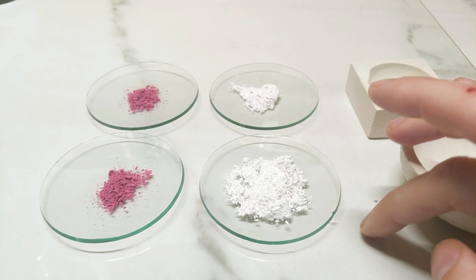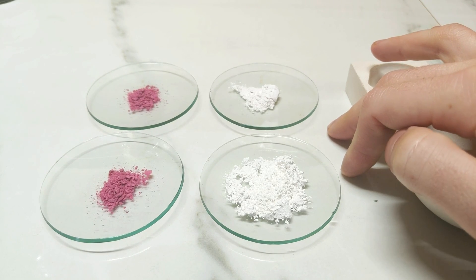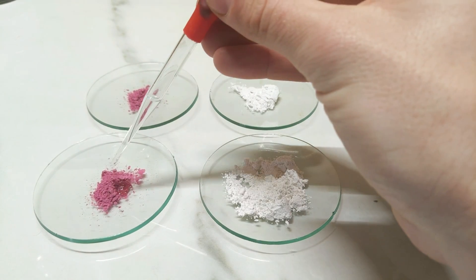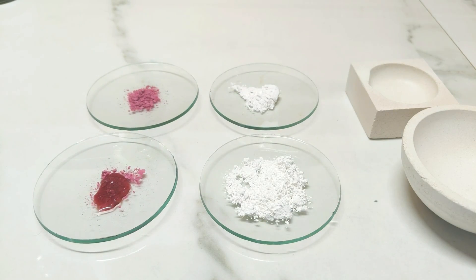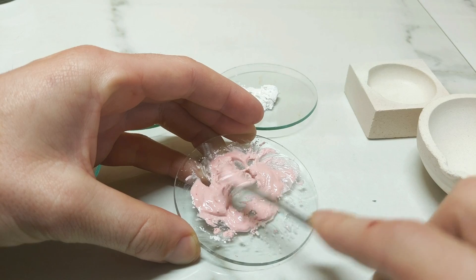I've got two lots of mixtures here which both have the same amount of cobalt but differing amounts of aluminium, so I want to see if there's a difference in the ratios and the final outcome of the blue. Just a tiny bit of water — as you can see it wants to dissolve quite rapidly. Just want to get the last of everything mixed in.